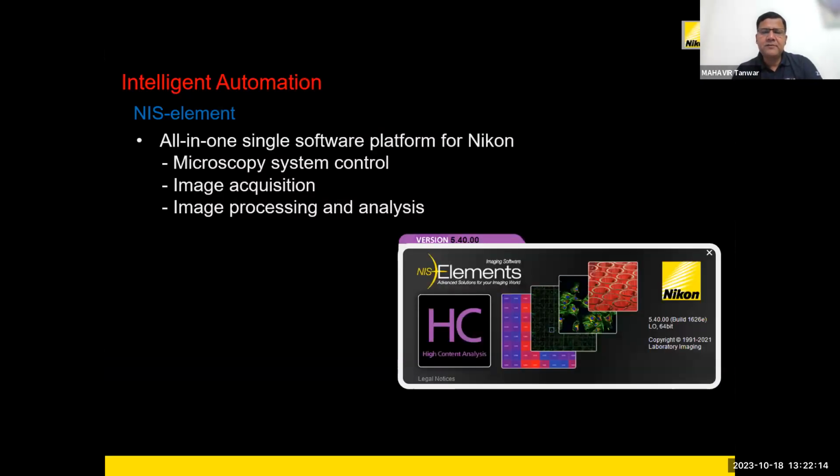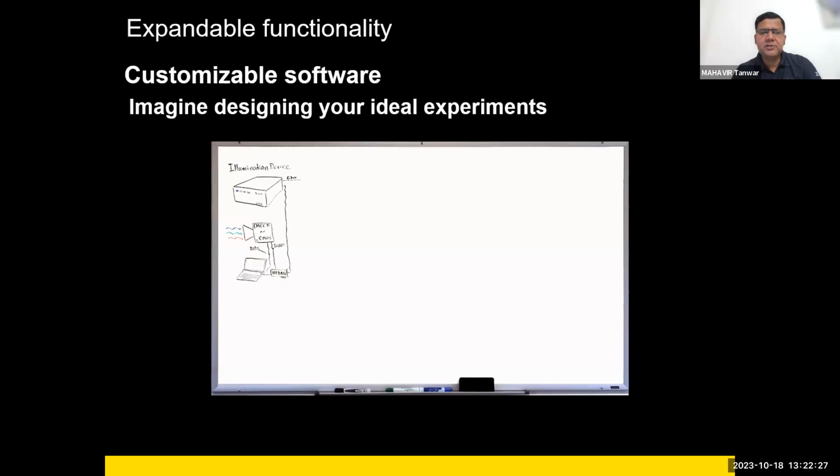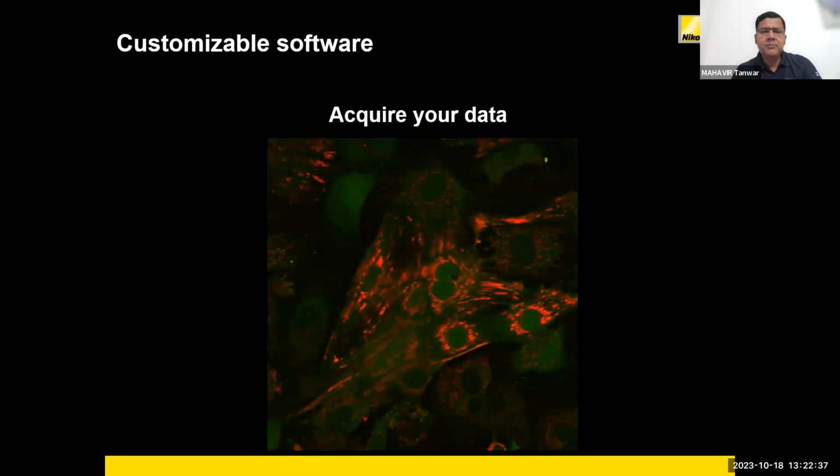Software plays a very, very important role these days because you need to do capturing, you need to perform quantifications based on what exactly applications you are doing. So everything can be done on these. The customization of the experiments, any conditional experiments you can perform. So maybe we can talk about this tomorrow. And also you can build your own experiments.